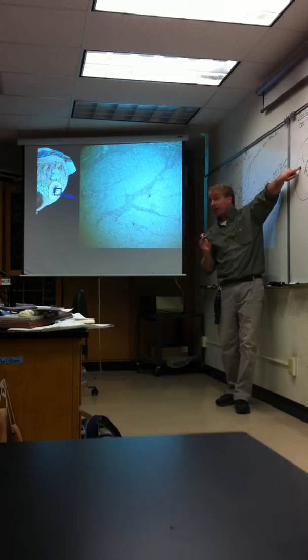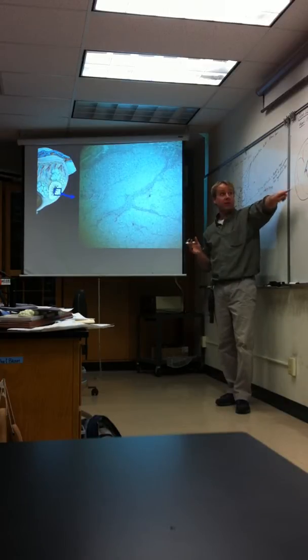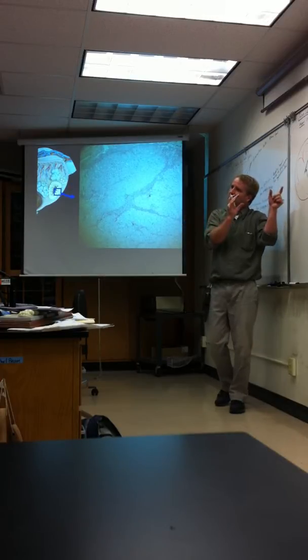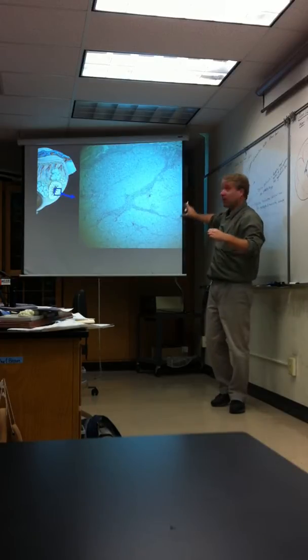And when you look at this particular slide, you'll see how big the corpus luteum is. It's more demonstrative of how big that mature follicle was too. That's also why I don't like doing the mature follicle on the prior slide, because the mature follicle is gigantic. And you can appreciate that with the corpus luteum.